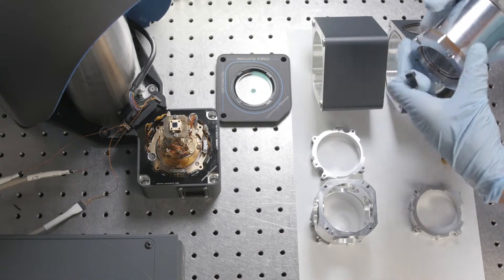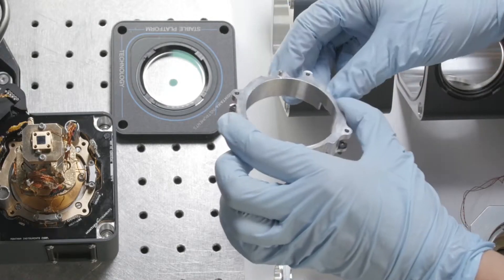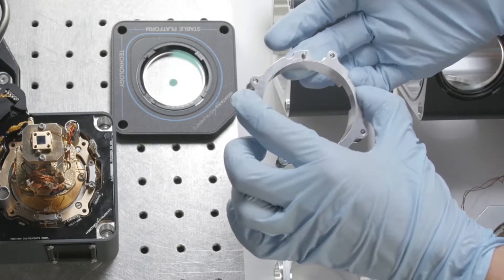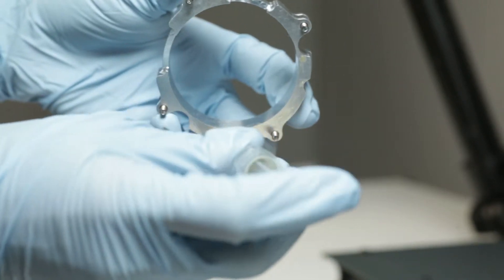Now we're going to install the base radiation shield. You'll want to make sure that there is a thin layer of N-grease between all metal-to-metal components.